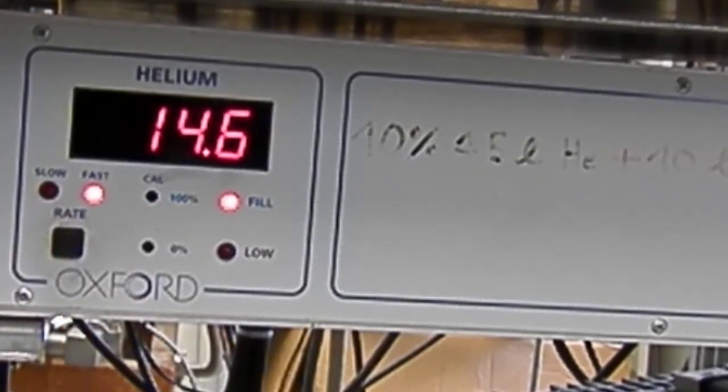Switch on the fast mode because fast mode means every one minute there is a measurement of how much helium is there during the filling process. You should switch from slow mode to fast mode.